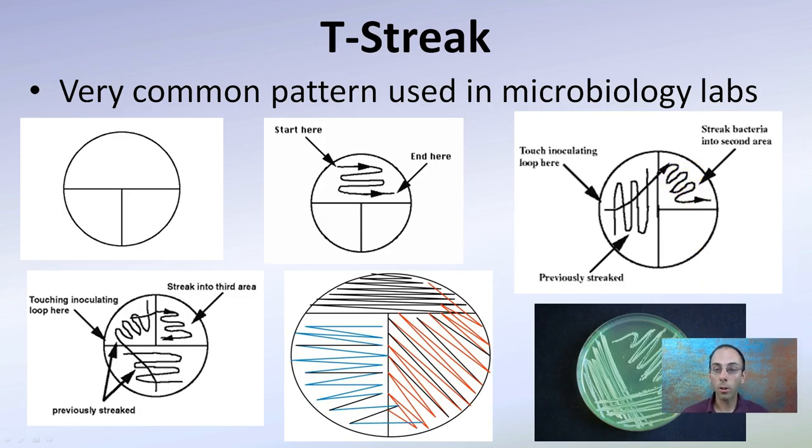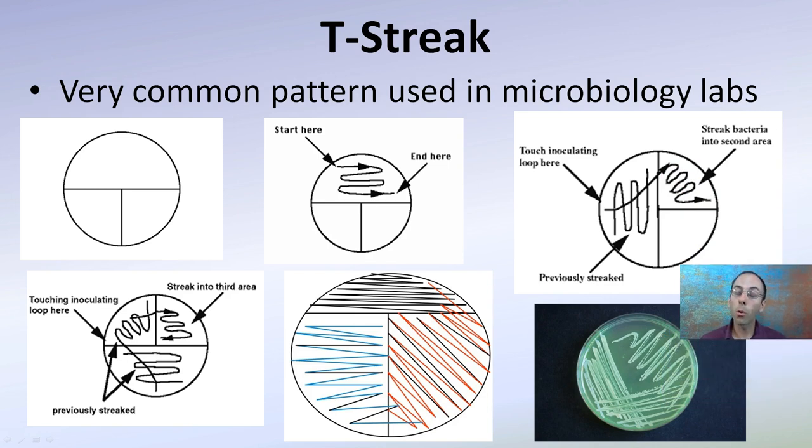This is called a T-streak, which is a formal term and a very common pattern used in microbiology labs because it looks like a T. You'll start here, zigzag back and forth, end here, then drag through that area into another region. Re-sterilize the loop and do it a third time. So you can see the initial streak, we drag through that, another spreading, and then a third. If it comes out properly, it'll look like this. This is great when isolating bacteria into individual colonies, allowing you to pick those colonies and transfer them to multiply on another plate later.